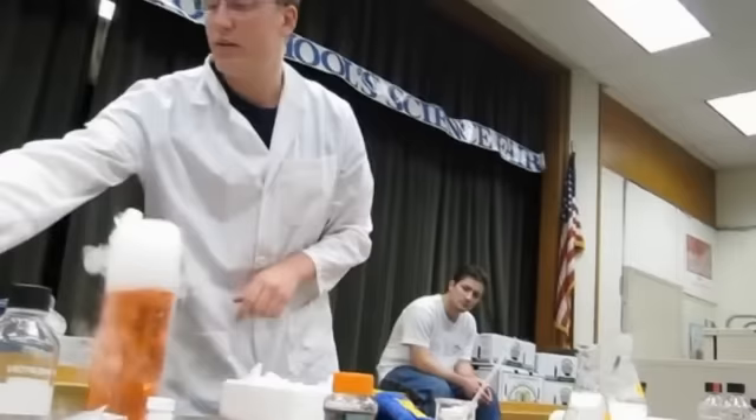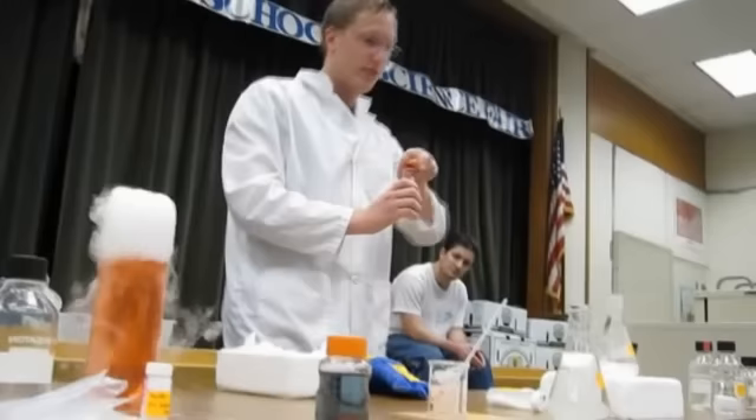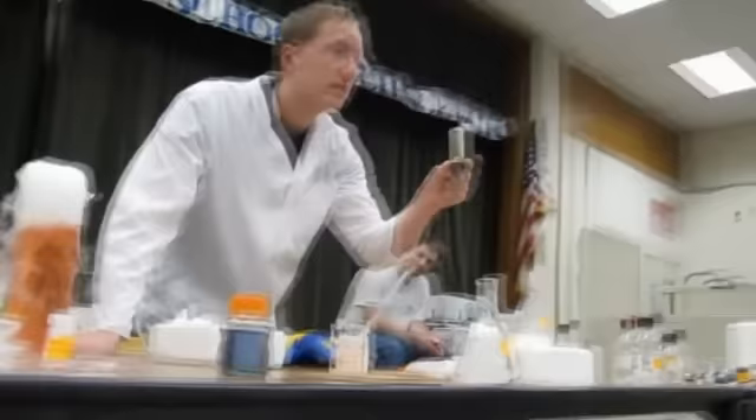Here I have some regular water. How do I know that? Well, let's use my indicator. It will tell me if it's an acid, a base, or something neutral. So if I have water here, what do I expect for a color? Green.